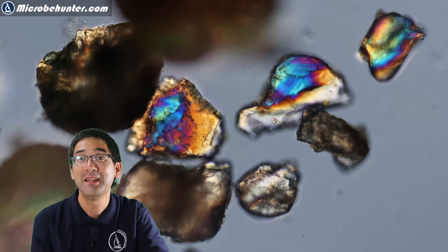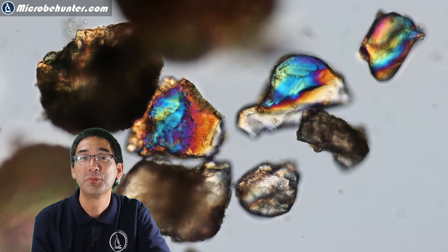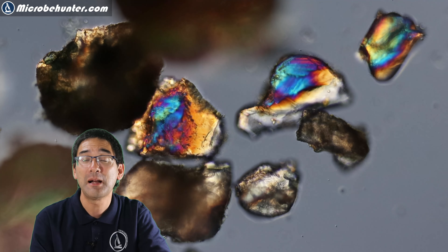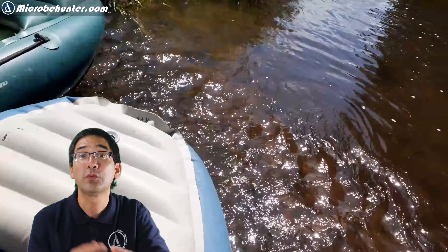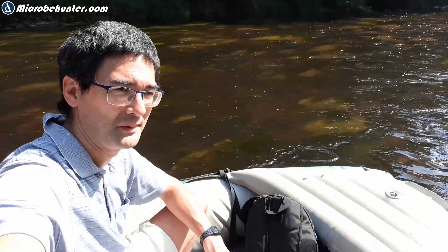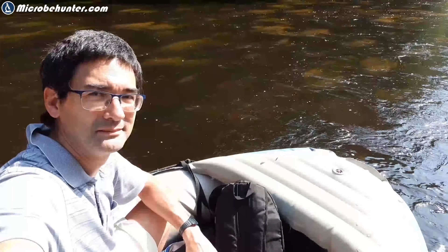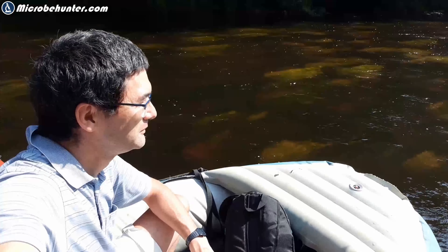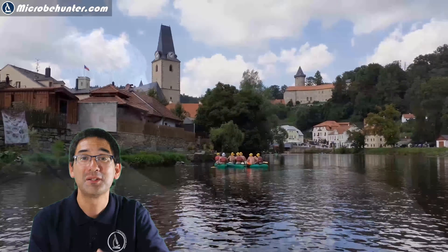There are plenty of things to observe here, and if you let the water sample stand — which I've done — more and different microorganisms start to grow. I recently put those water samples again under the microscope and was able to discover many more ciliates, possibly paramecia and others, growing there because the standing water allows those microorganisms to multiply.